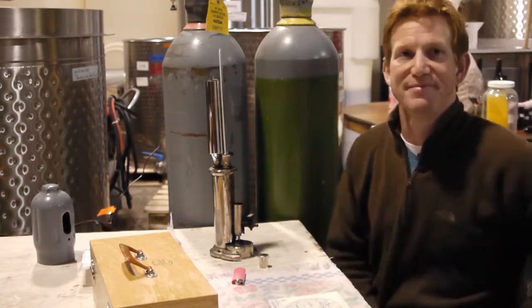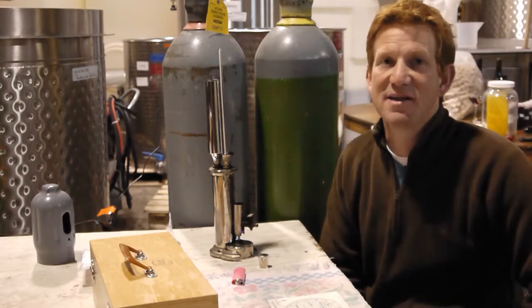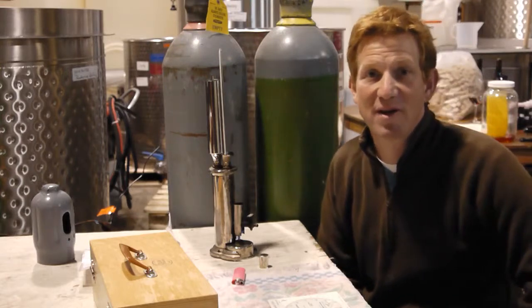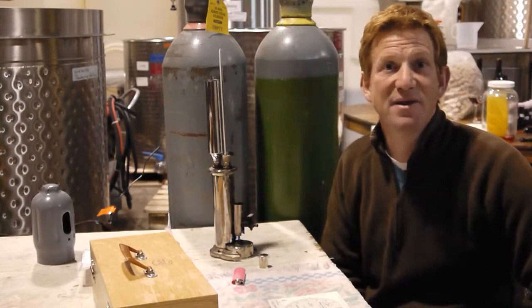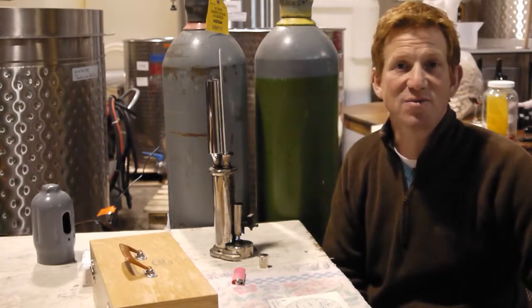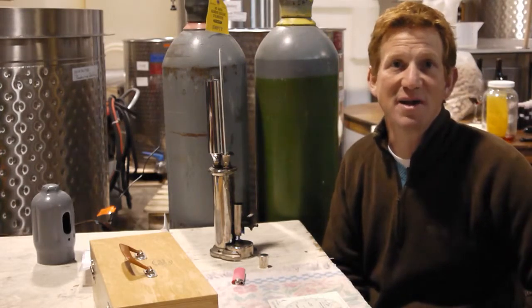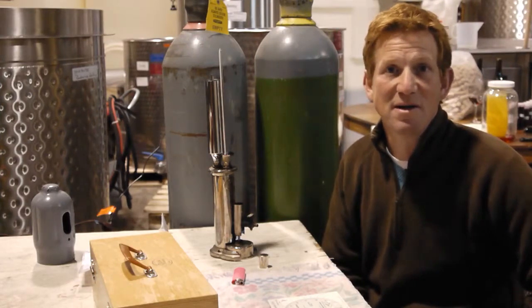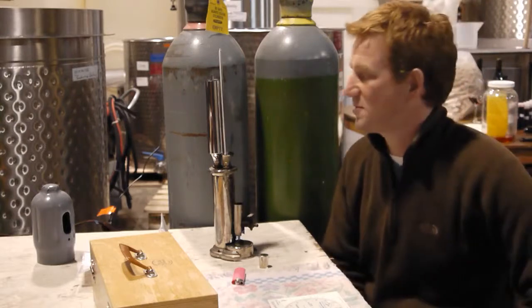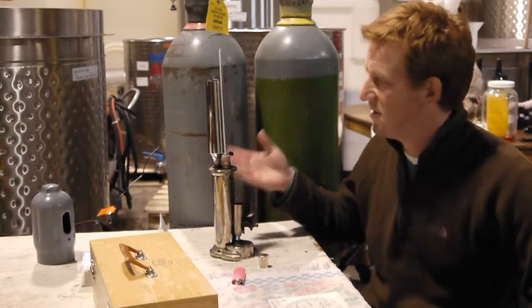What information do you get from this? It leads to the number on the label — the 14.5 or the 13.5 that is on the label — this is one way to determine it. There are also analytical methods that use precise scientific instruments in very big laboratories, but we are using this one, which is the tried and true method, the ebuliometer.